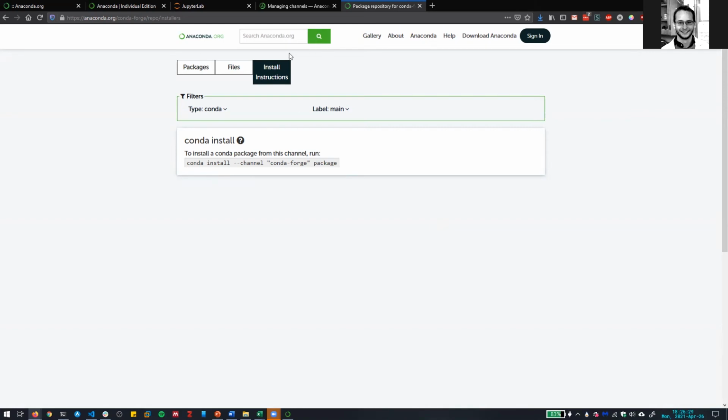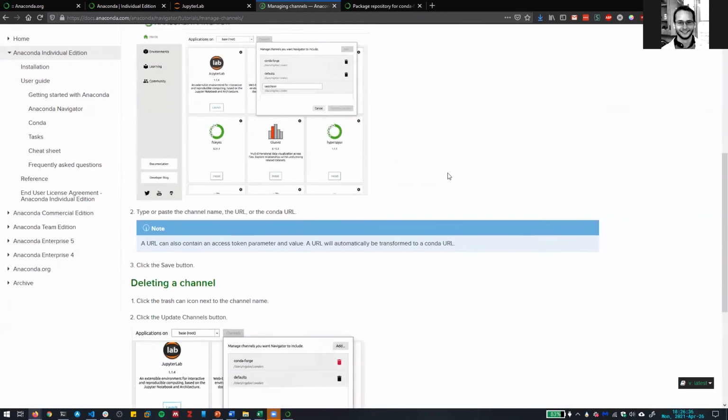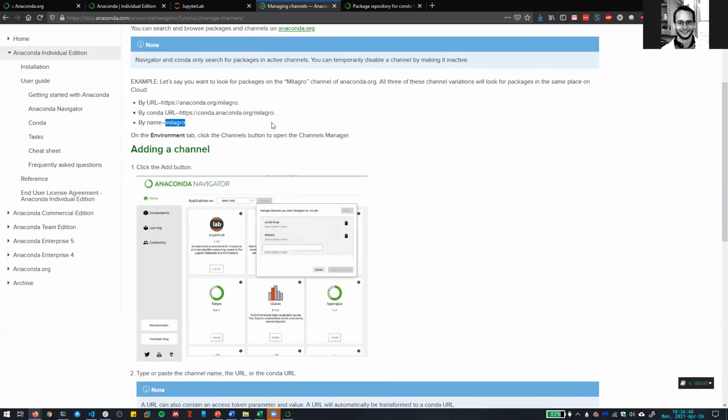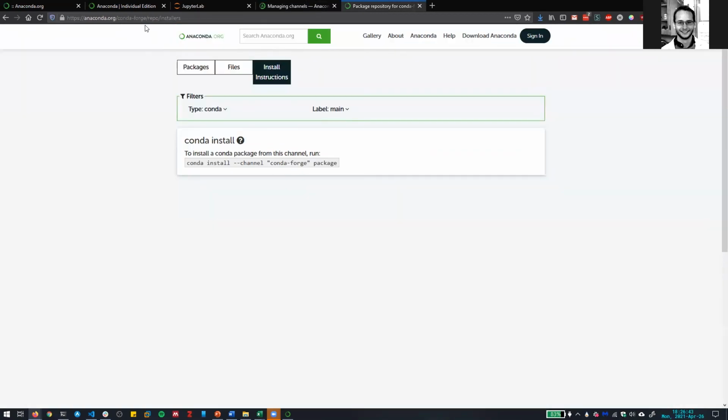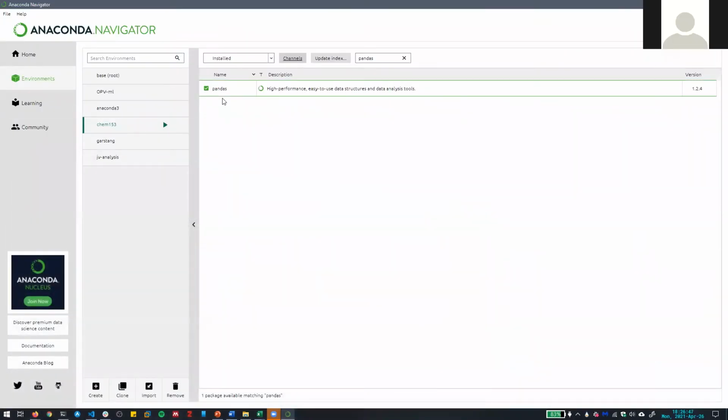Oh, right, this isn't it, never mind. You want to add Anaconda. Let's see. Wait, it worked. I think I just misspelled something. Okay, great.